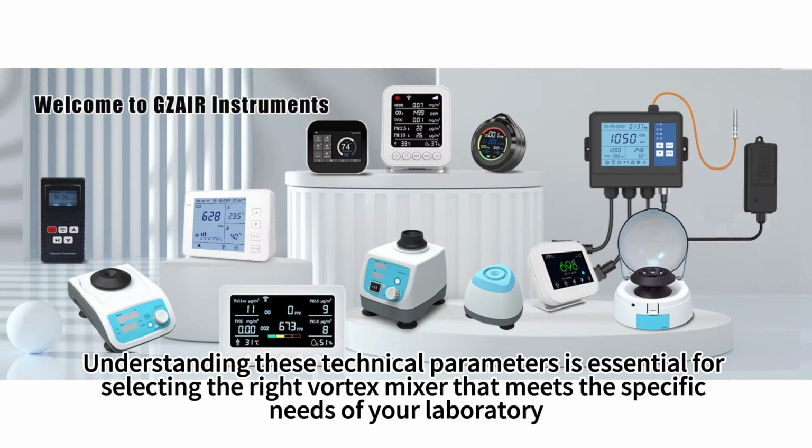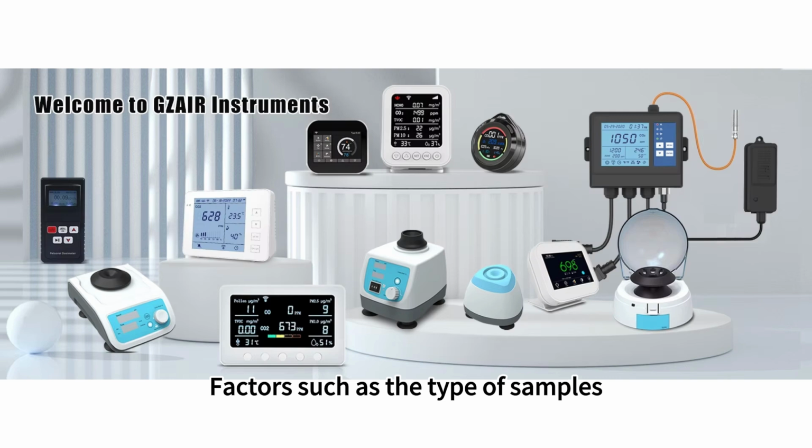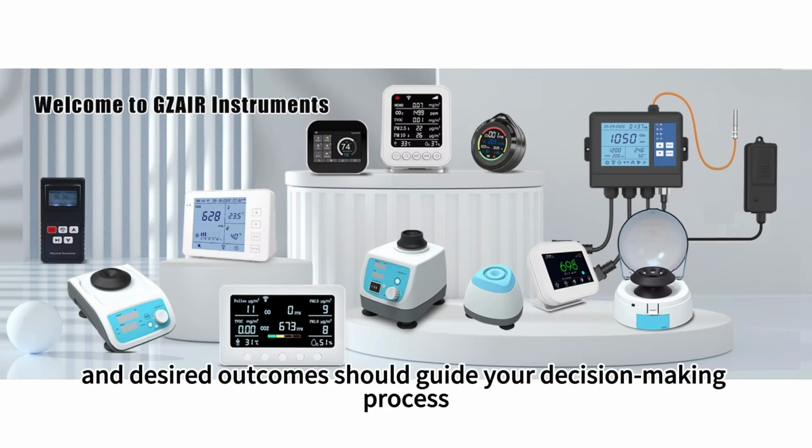Understanding these technical parameters is essential for selecting the right Vortex mixer that meets the specific needs of your laboratory. Factors such as the type of samples, frequency of use, and desired outcomes should guide your decision-making process.